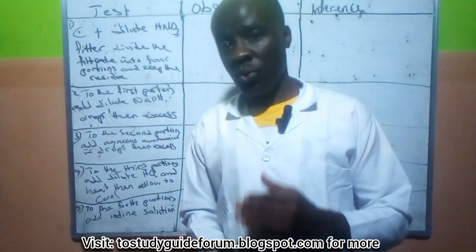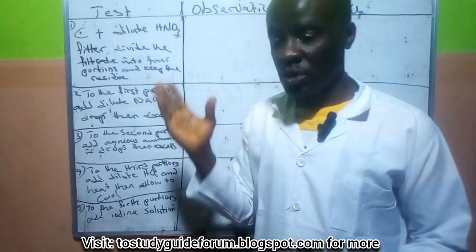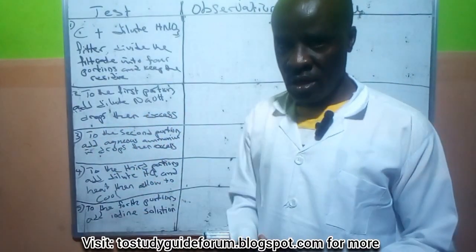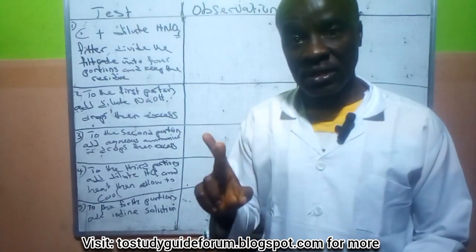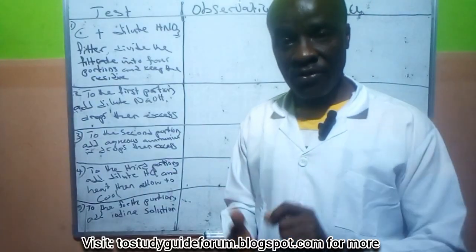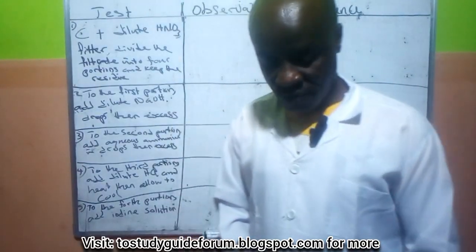I want you guys to pay attention and watch very well, because I'll have two methods of identifying lead, one of which is somehow hidden in this. It is not very obvious in the information paper. We have two tests. One, and the second one will really blow your mind. That's why I want to encourage you to pay attention. Even if you miss copying down some things, you can still do it. All right, let's go ahead and do justice to what we have here.